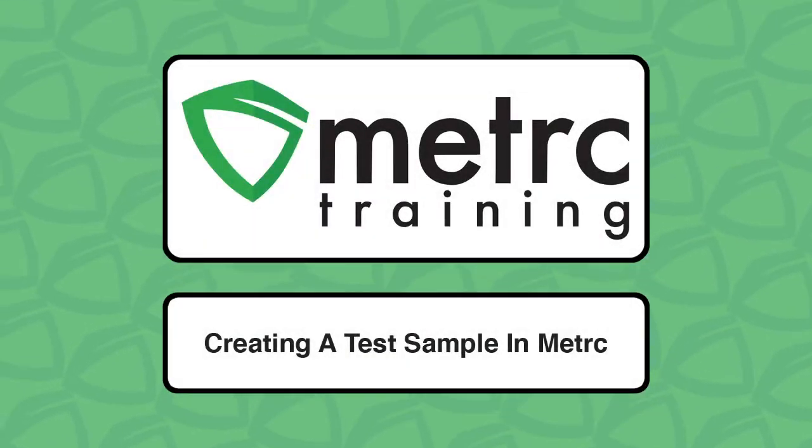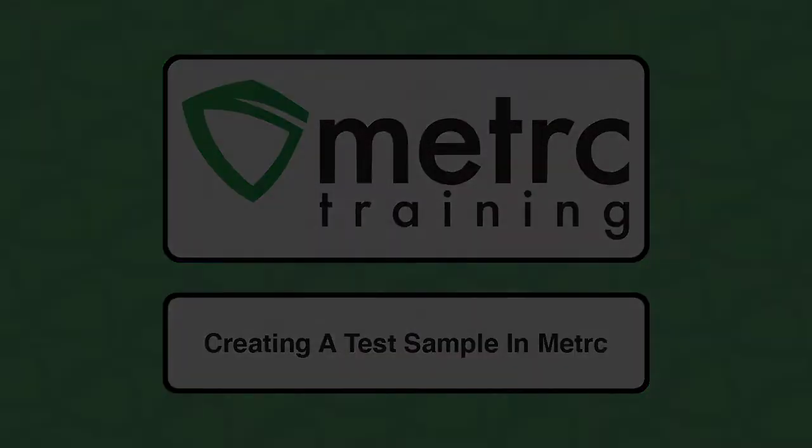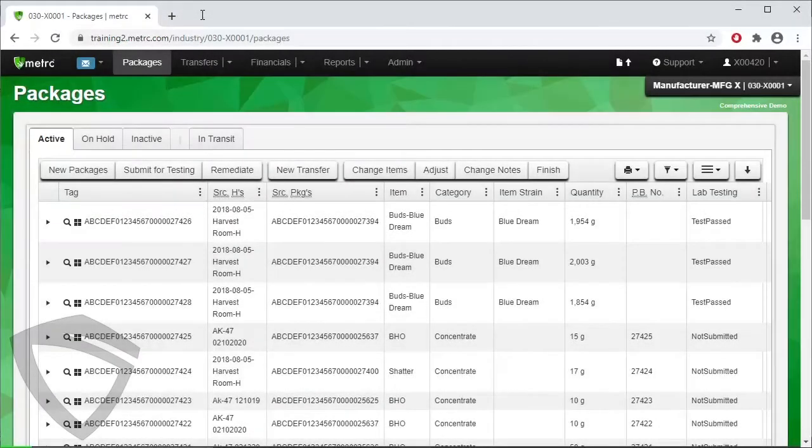Creating a test sample in Metrc. The look and options you see in Metrc can vary depending on the state you're operating Metrc in, but the functionality of the software is the same. Therefore, the demo you will see in this video may look different from what you'll see in your license, and may involve a few different steps, but the functionality of creating a test sample in Metrc will be the same.